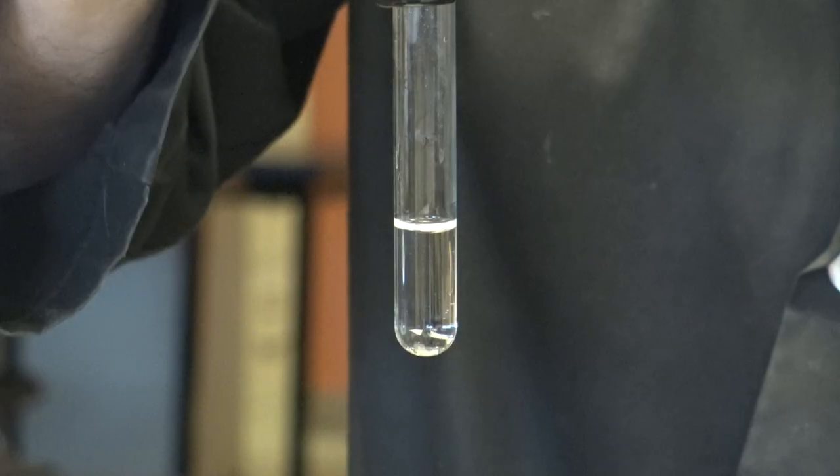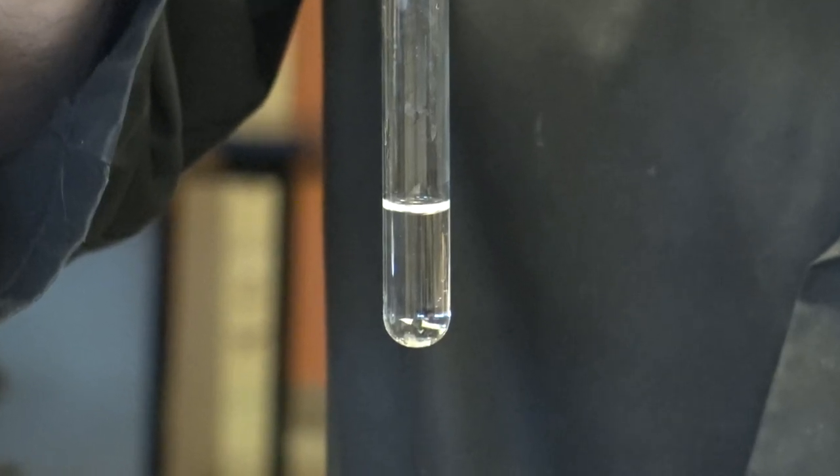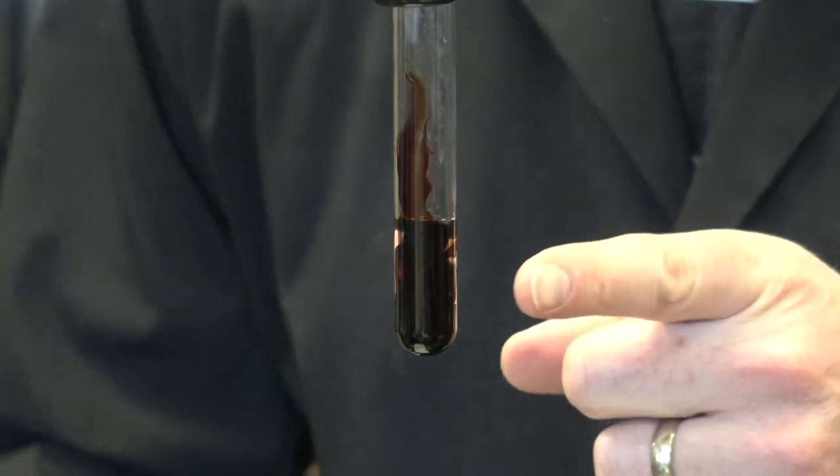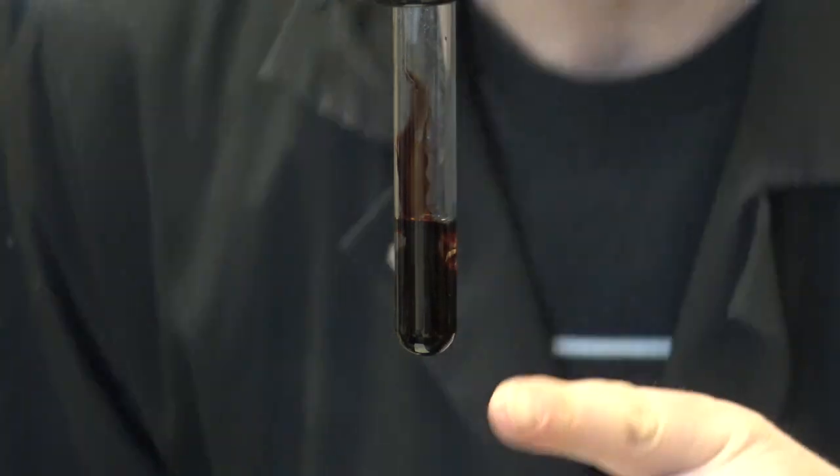Here we go. One drop to start. Look at that. Can you see that over there? It's like full-on blood.